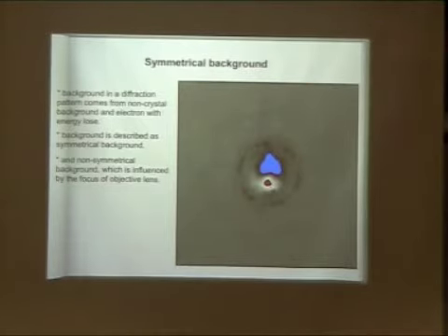And this is particularly severe if you have a tilted specimen. I mean, you don't have to have perfect focus; 1 micron or so off doesn't matter. That's why with an untilted specimen it's quite simple. You focus once, and you can take all the diffraction patterns for the entire day without a problem. But if you have a tilted specimen, particularly 60 or 70 degrees, then from one area of the specimen to another, the height changes dramatically. So your focus in the image also changes a lot.